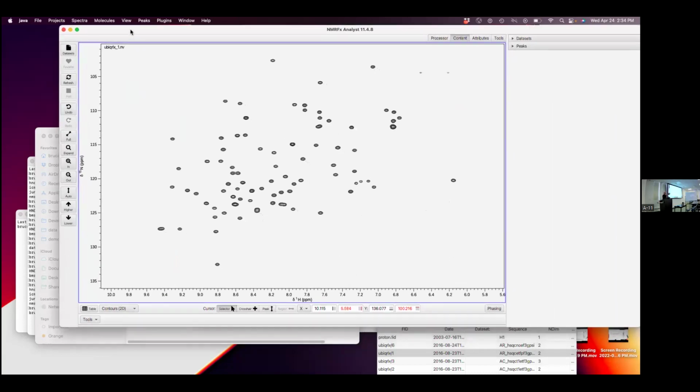Basically, when you save a project in NMRFx, it saves everything in a BMRB style star file. And we can now just say fetch and go to the BMRB and pull down a star file. That warning was basically saying, I've already got work going on, I don't want to blow away everything I've got. We're soon adding the ability to just say grab the chemical shift assignments and stuff, not everything there.